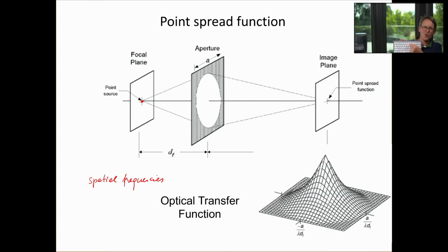And of course, if I make the keys smaller, I can fit more keys in per row and per column, and the spatial frequencies go up. And you can just about imagine, if I make the keys very, very small, then you will not be able to see them anymore. You will not be able to resolve them, because the imaging system will not process all these spatial frequencies. So one way to think about a microscope is in terms of a spatial frequency filter. So spatial frequencies will be lost. And the better the resolution of the instrument, the higher the maximum spatial frequency that you can pass through it is. And so the concept to remember, you don't need to understand the full details.